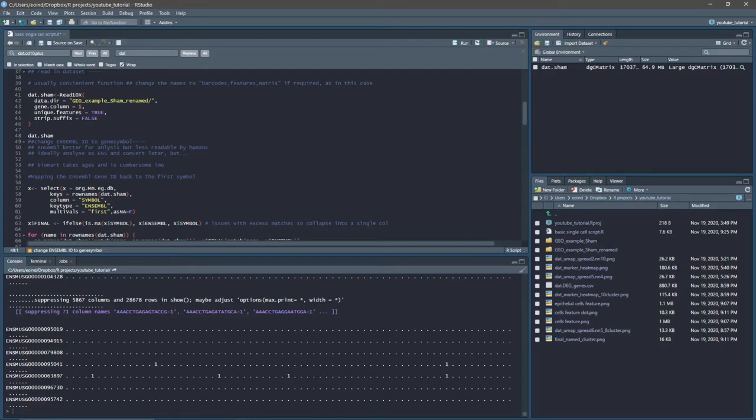Some will map to 2, some will map to none, and they are more unique, and it's much more correct to run your analysis fully using the Ensembl IDs and then find some way later to convert to gene symbols to make them a bit more human readable, which is quite easy. If you're just doing something like a differential expression analysis, you can easily convert your matrix at the end. It's somewhat trickier when it comes to changing the labels on plots, but it's entirely doable.